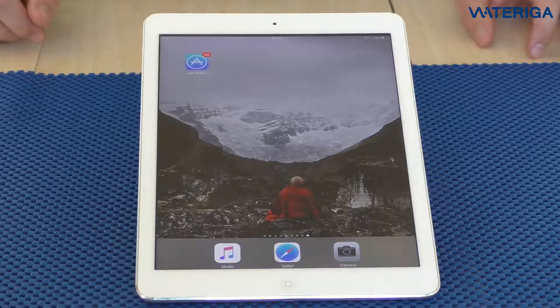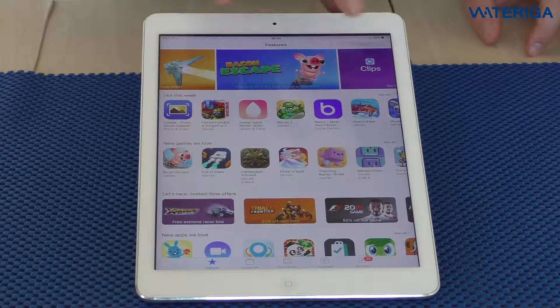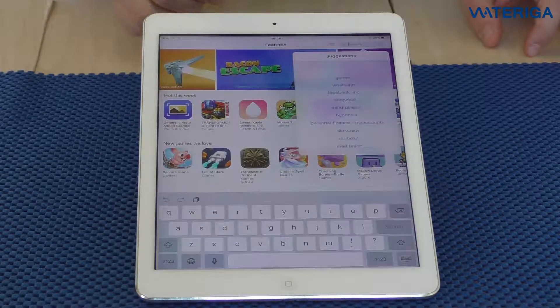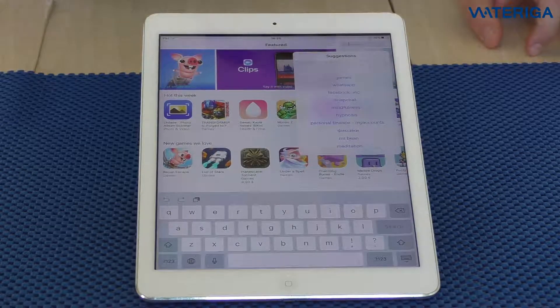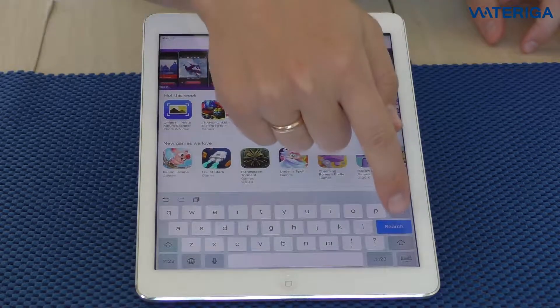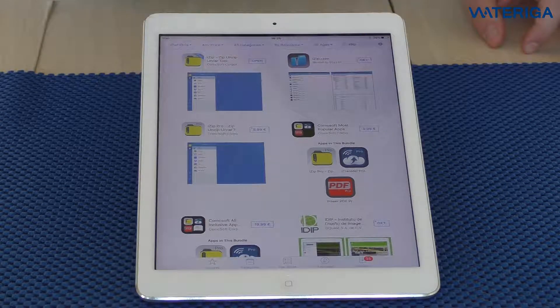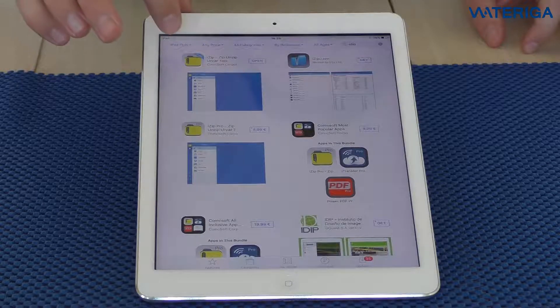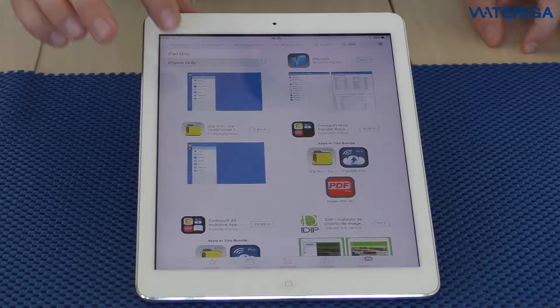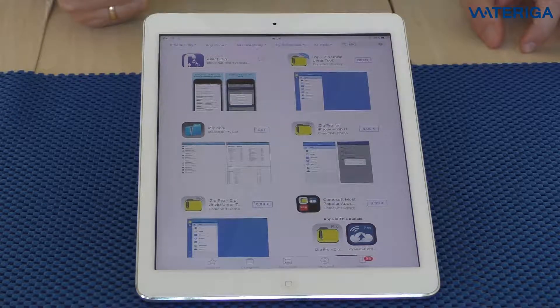In order to use the Xact i-Dip you need to download the app. Open the app store, hit the search bar, and type in Xact i-Dip or just i-Dip, then hit search. If the app is not seen, you can choose the filter to show iPhone apps as well. Then the i-Dip app is shown — hit download. Now you can start using the app.